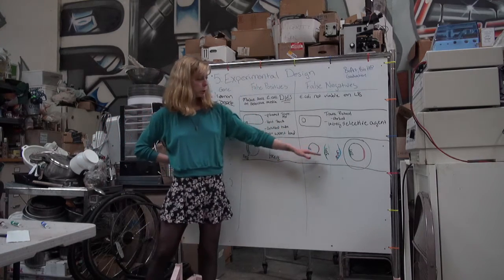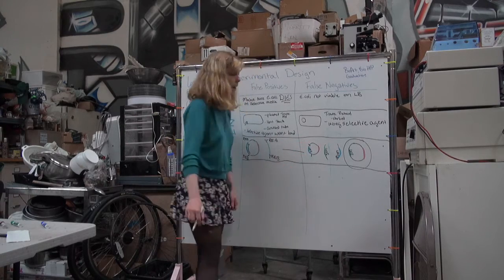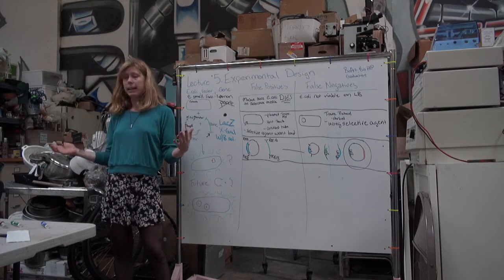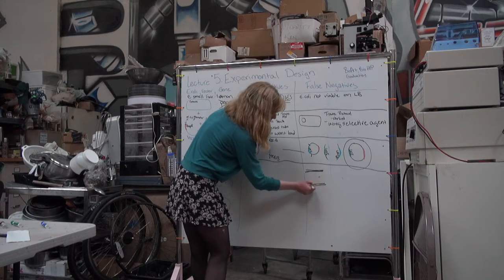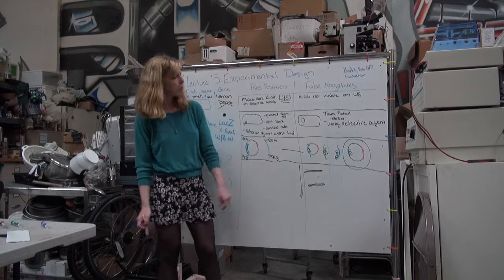Sometimes you can choose to purify your cut product on a gel electrophoresis, which separates things by size. So you're going to get two bands. You're going to get the part you want, and then the LacZ piece, which is just going to be further down because smaller pieces migrate further.